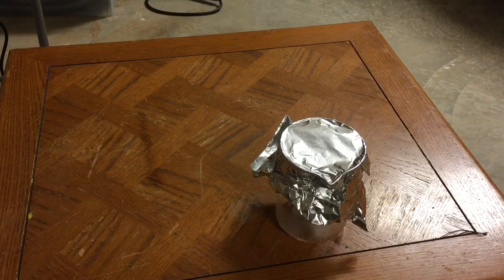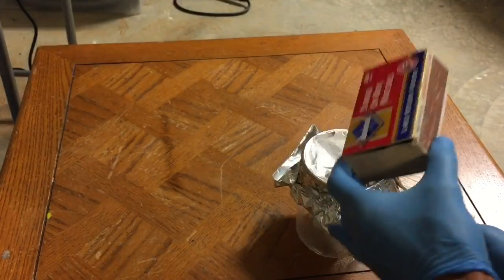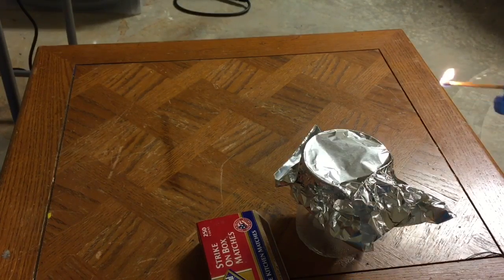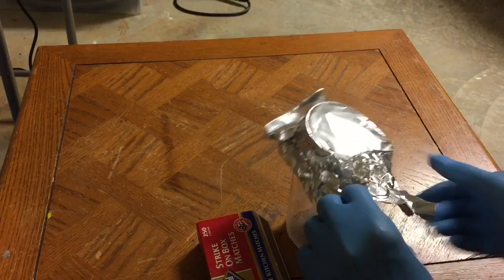We can be assured that there's CO2 in there. The first thing I'm going to do is strike a match and see how the CO2 gas extinguishes it. I have a match and a matchbox, and I'm going to strike the match and briefly put it in there — and as you can see, it goes right out immediately.